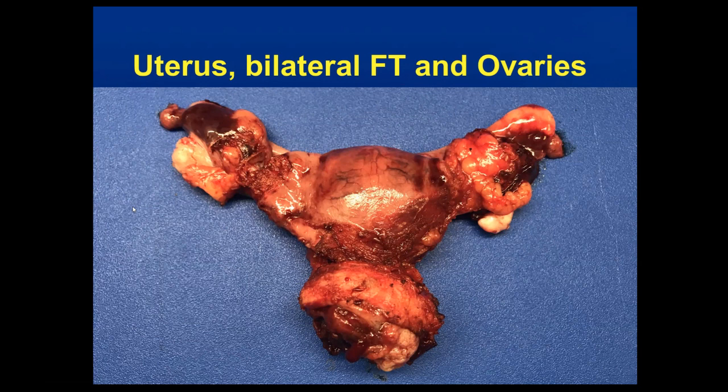have your hysterectomy. And everybody knows that in this situation, you're supposed to assess the depth of myometrial invasion. But you should not forget that that's not your only job, okay? You need to inspect this hysterectomy grossly. And the first thing that jumps at you, you see how the cervix is massively enlarged. And you should also look around, look at the peritoneal surface, look at the ovaries and fallopian tubes.